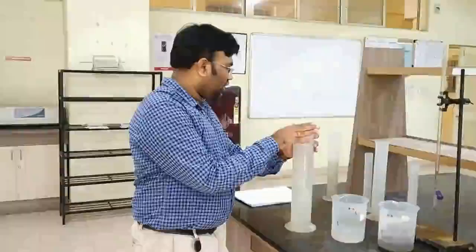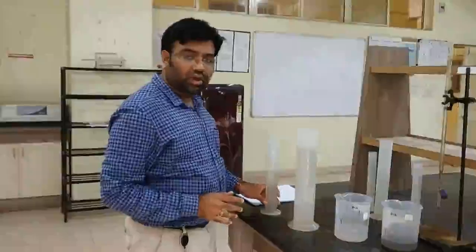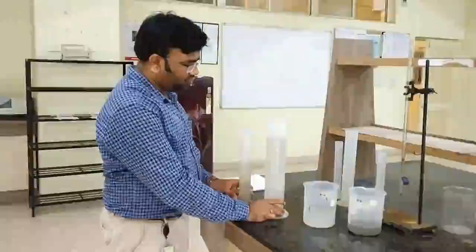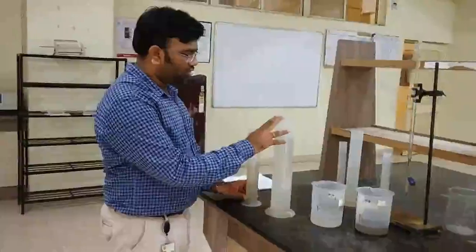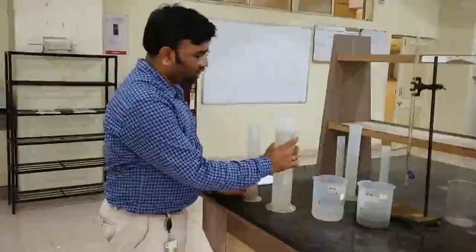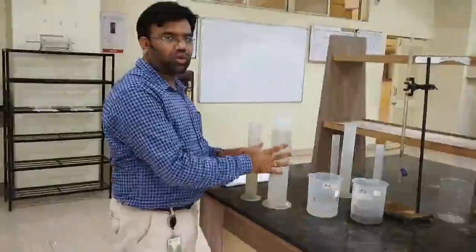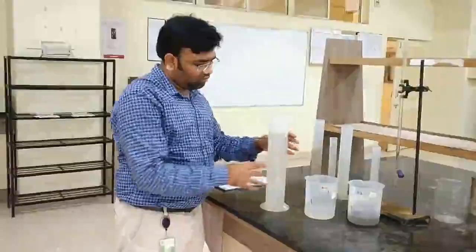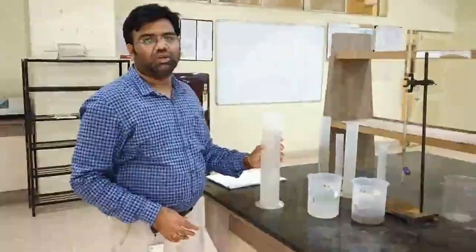So now the dilution factor of this is 400. How has it come to 400? Previously it was 10 here, right? We have taken 25 ml from this and then made it up to 1000 ml, so the dilution factor here is 40, and the earlier dilution factor was 10. So 40 into 10 gives 400. So here we have achieved the dilution factor of 400 for this particular sample.